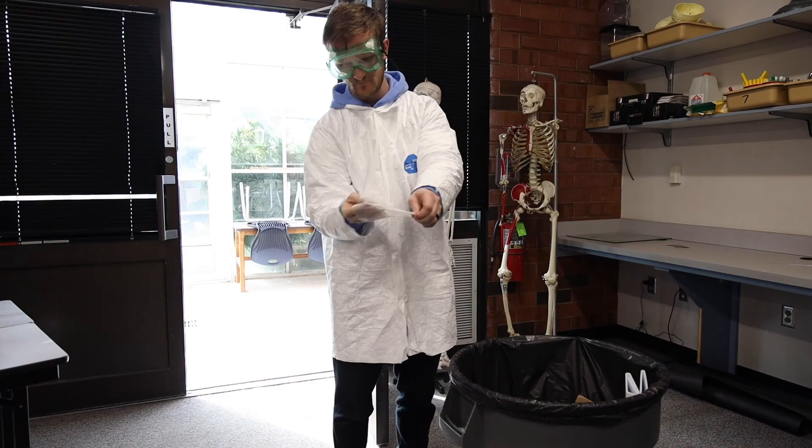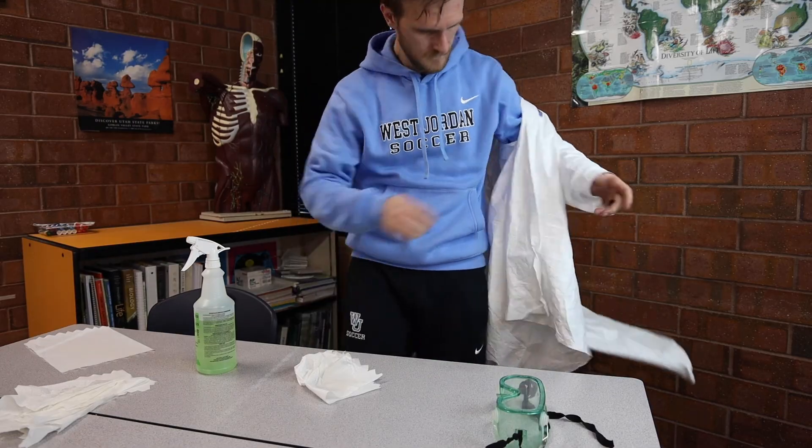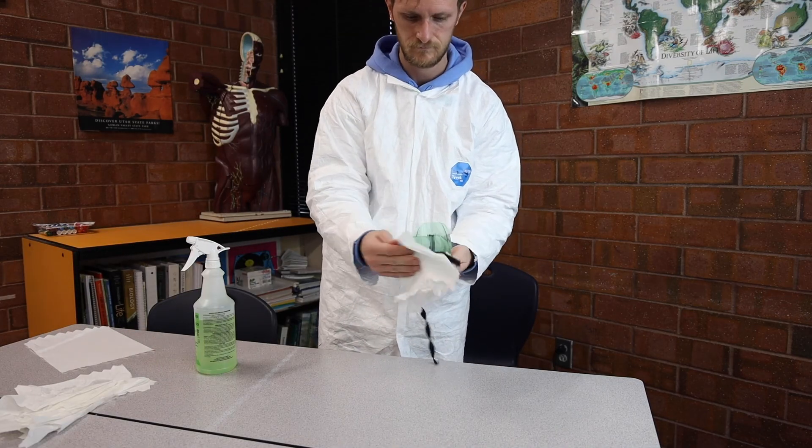Finally, remove the gloves, your goggles, and your laboratory coat. Make sure you wash your hands and clean your workstation properly as directed by your instructor — this will ensure that we have a clean and happy workspace to come back to next time. Thank you very much for watching, and I hope you have a smashing time with your upcoming dissection.